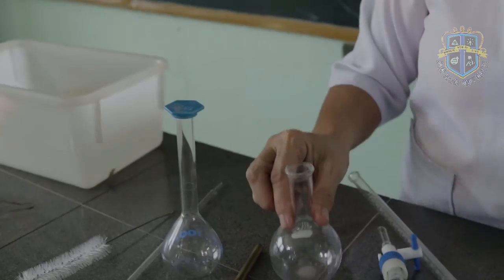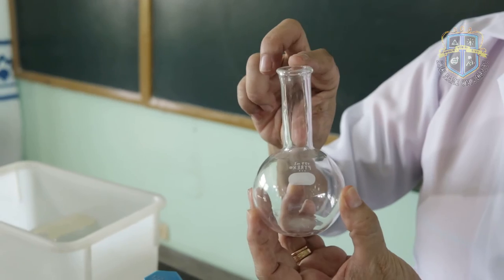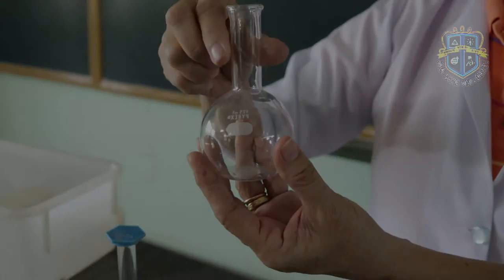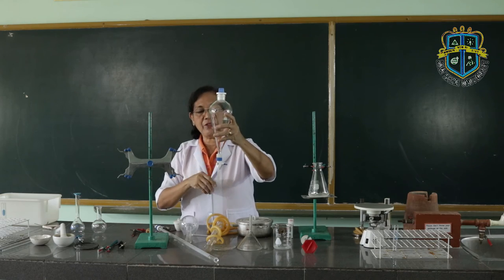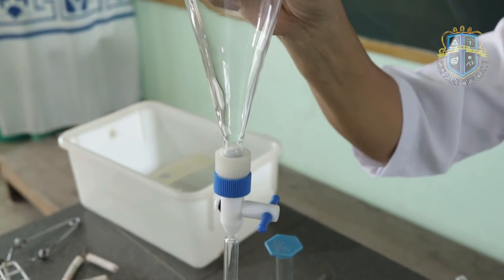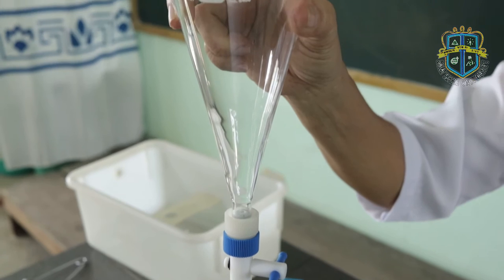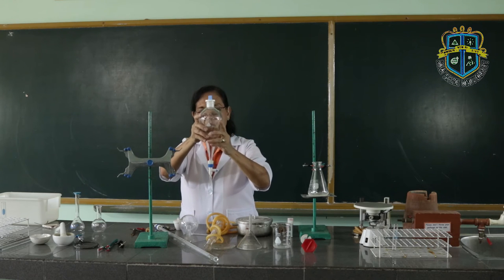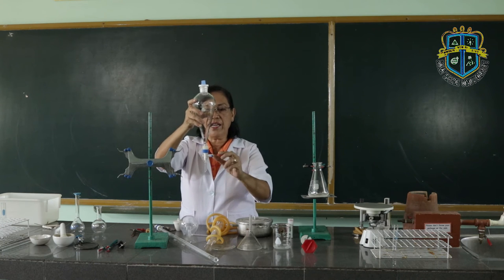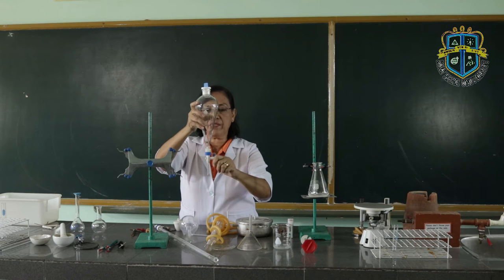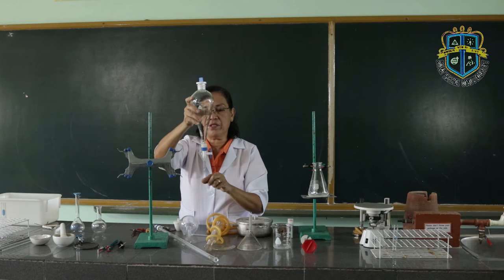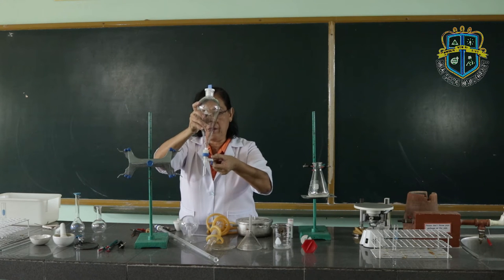This is the Florence flask, with a longer neck and a rounded bottom. This is a separatory funnel. The separatory funnel is used to separate two or more immiscible liquids. When you have the content inside the separatory funnel, you turn the valve so that the liquid flows down the tube, then close the valve.